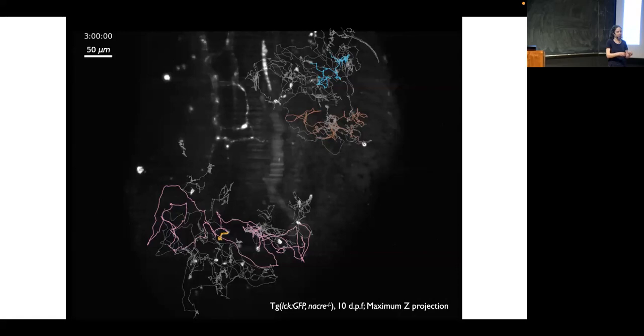Your sepsis model. Have you considered using microinjection and using localized infectious agent, or using some of these compounds in a very specific spot? The question was, have we considered microinjection and other techniques in a specific spot to watch a response.